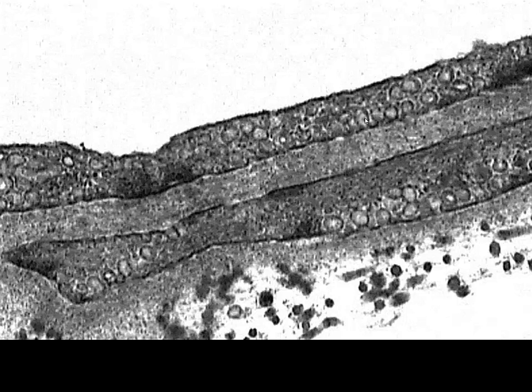Here we can see the caveolae, or the pinocytotic vesicles, adjacent to the lumen. These are the pinocytotic vesicles of our endothelium, and these are the caveolae of our smooth muscle cell. Remember, these are the structures that store calcium in smooth muscle, and these are just the transport vessels for our endothelial cells.